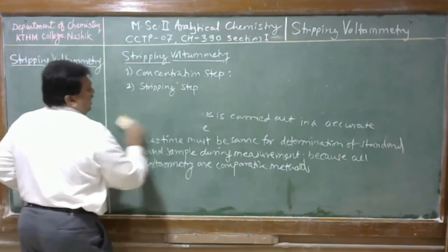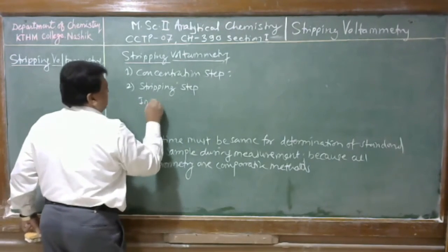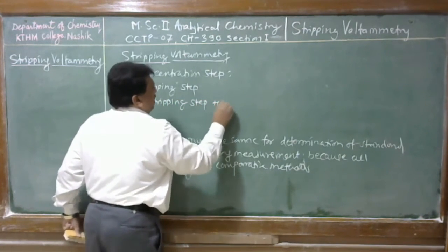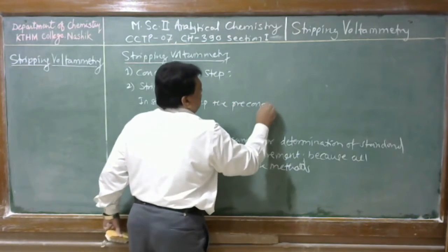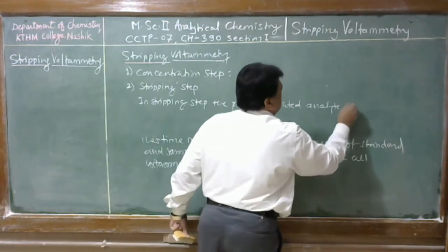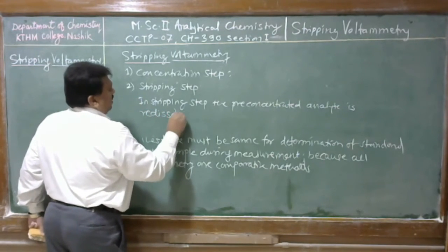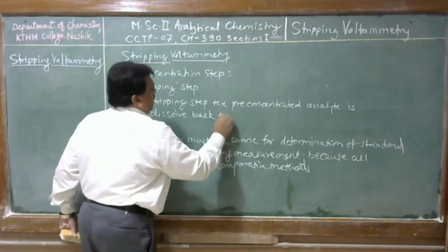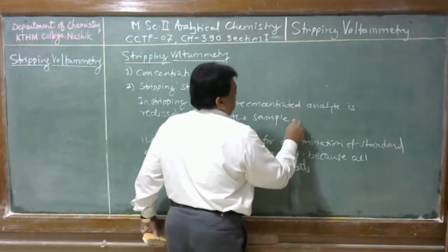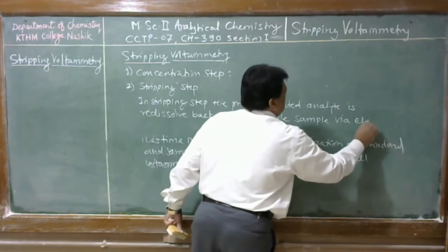In stripping step, analyte is redissolved into solution. In stripping step, the pre-concentrated analyte is redissolved back to the sample solution via electrolysis process.